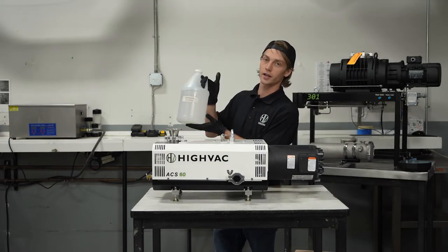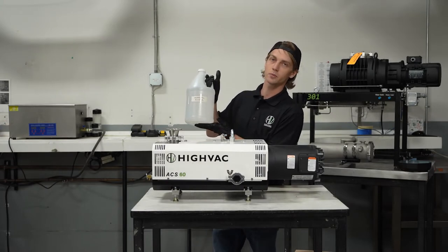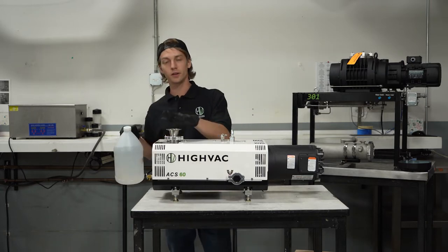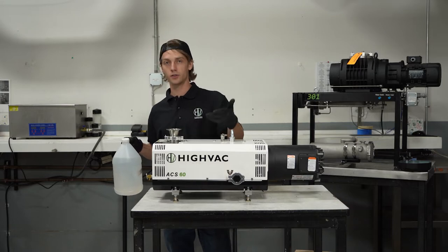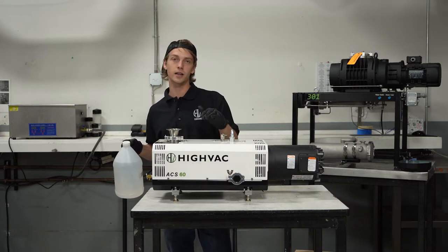Next, we're going to take our solvent — which is isopropyl alcohol — and fill it into the inlet until it's completely level. Allow it to bubble down and then continue to fill until the pump stops taking any more solvent.